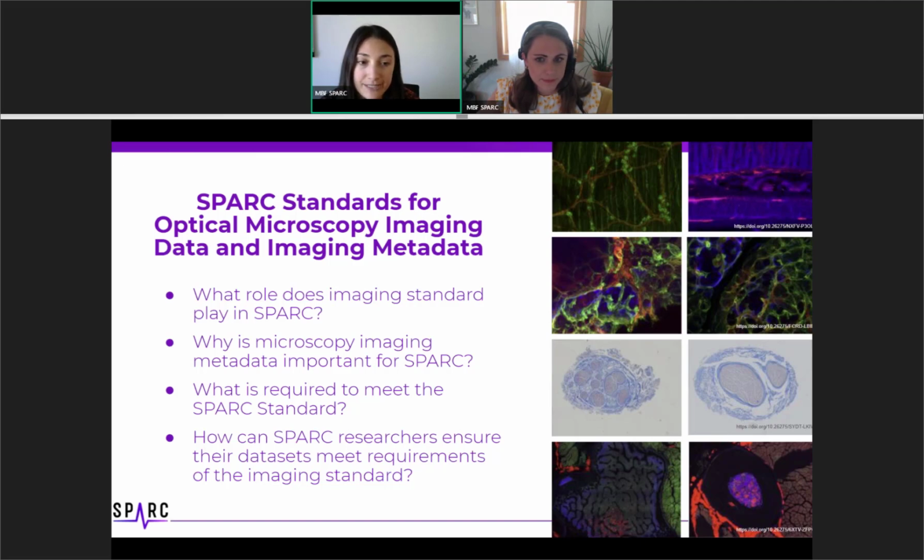MicroFile Plus writes this metadata to the header of the file, not a sidecar, and in accordance to the OME TIFF specification. This tool makes it easy to produce image data that can be readily shared and disseminated, whether that's within your lab or to others in your department or to the public on a data portal such as the SPARC portal.